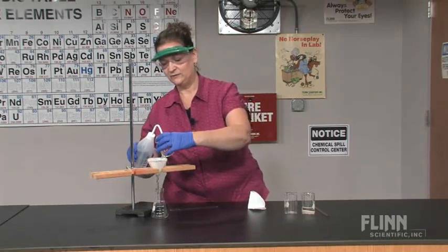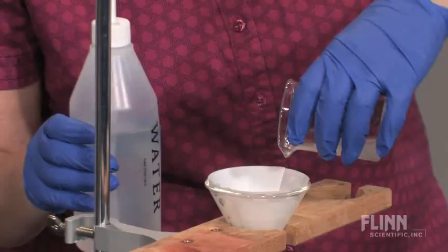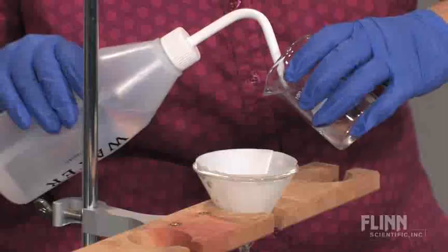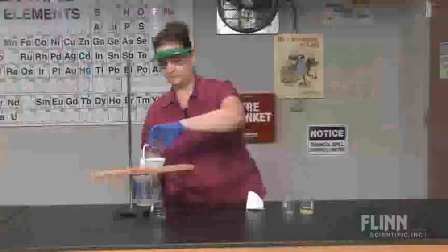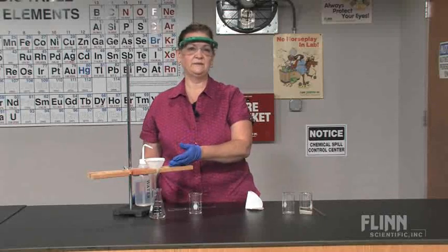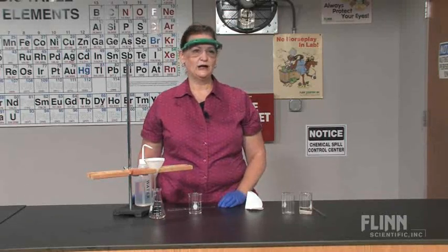Then rinse any remaining solid with distilled water and pour that in. This may take a few rinses. Once all the liquid is filtered through, you can remove the filter paper with the collected solid and allow it to dry.